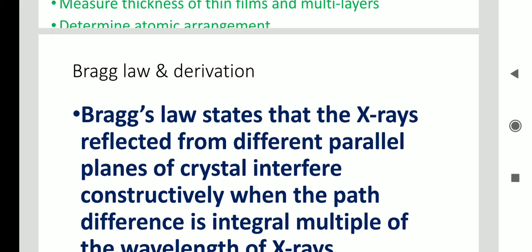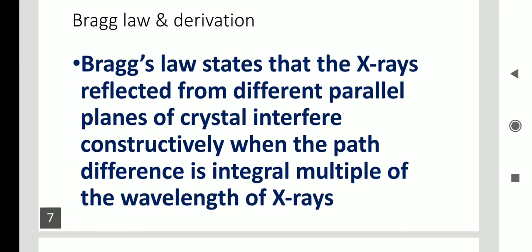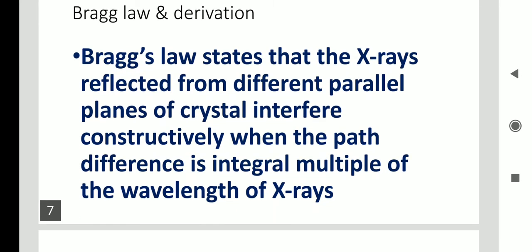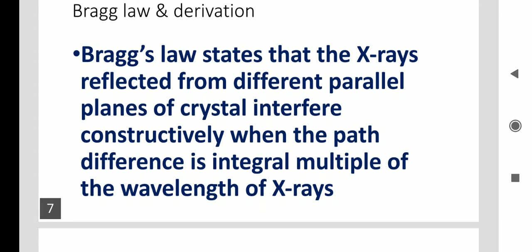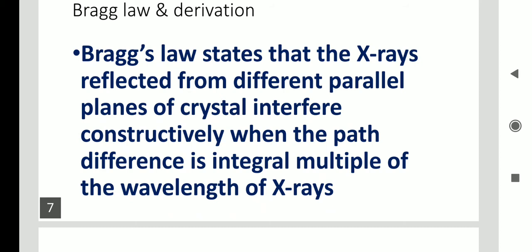One of the important concepts here is Bragg's law and its derivation. Bragg's law states that the X-rays reflected from different parallel planes of a crystal interfere constructively when the path difference is an integral multiple of the wavelength of X-rays.